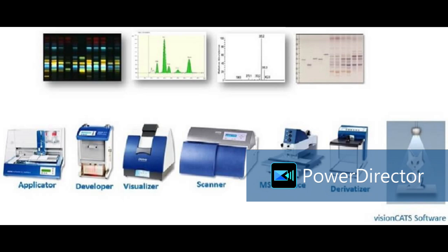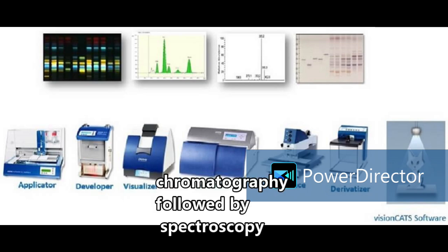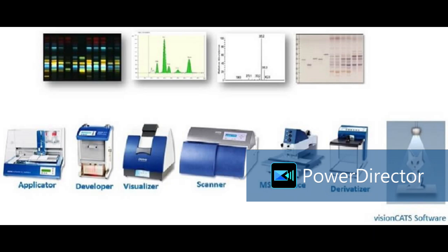No, ma'am. It is still a modular system, and we are using it in a little bit of a traditional way. After sample preparation, we are applying it on the TLC, HPTLC plate. We are running the plate in mobile phase in development chambers, and up to this is chromatography. After this step, these are all spectroscopy and other techniques for detection. They come as separate devices. These are all different modules. You can see them in our lab also. All these modules are here.